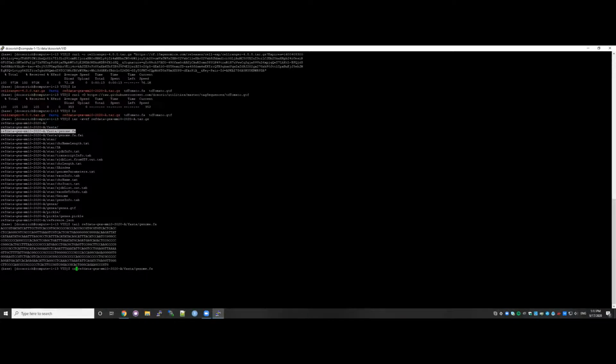I'm going to use cat, that is the concatenator. I'm going to put the first file, that will be the genome, and then the TD tomato FASTA file. With both of them, I'm going to save a new file that I'm going to call tag genome.fa.